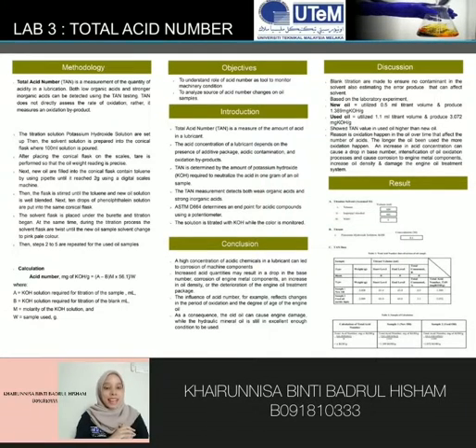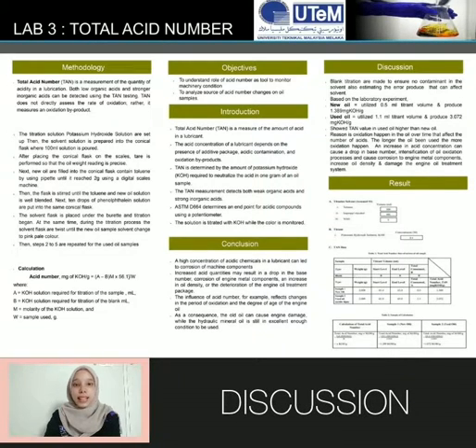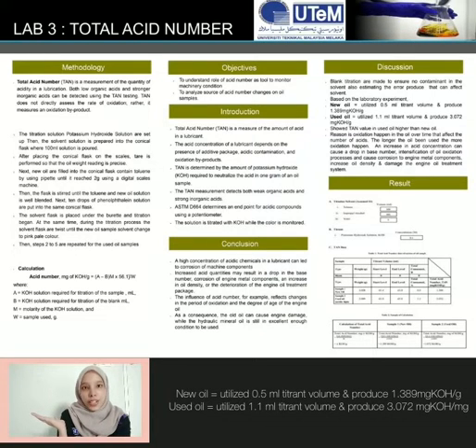Hi, I'm Lisa. Next, blank titrations are usually made before the titration begins. This is to ensure that there are no contaminants in the solvent and also to estimate the error produced that can affect the solvent. After the blank titration is done, next we'll go into the result of the real titration.